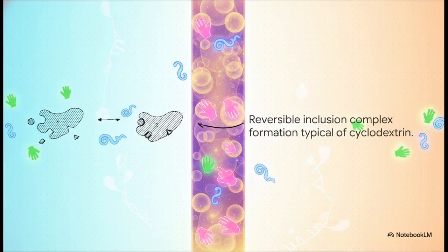As the racemic mixture passes through, these temporary non-covalent diastereomeric complexes form. And because these complexes have slightly different interaction energies, one enantiomer gets held onto, or retained, just a bit longer than the other, which completely separates them as they flow out of the system.